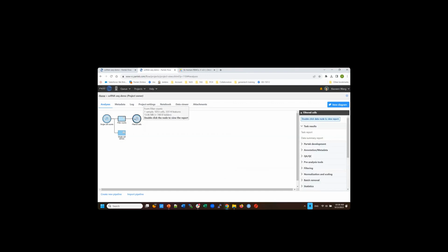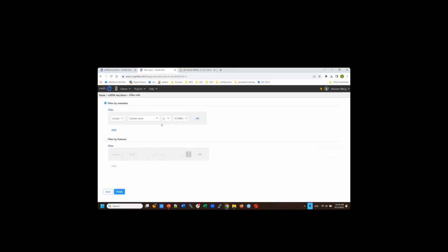Also, on any count matrix, you can perform a filter from here. If you want to filter cells, you can also build a rule to filter cells. If you say, I want to base it on my number of expressed genes being greater than such and such, you can use this option to perform exactly the same filter. But with this one, you don't have the visualization. You just pick a number, like if you use Seurat, and put a name there to give it a try.